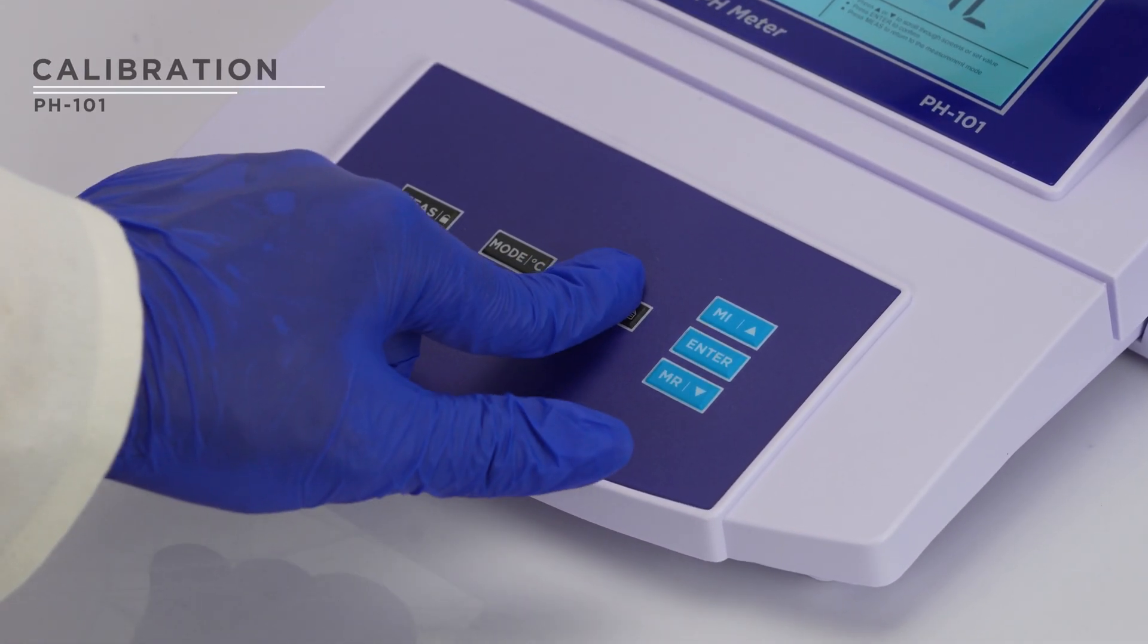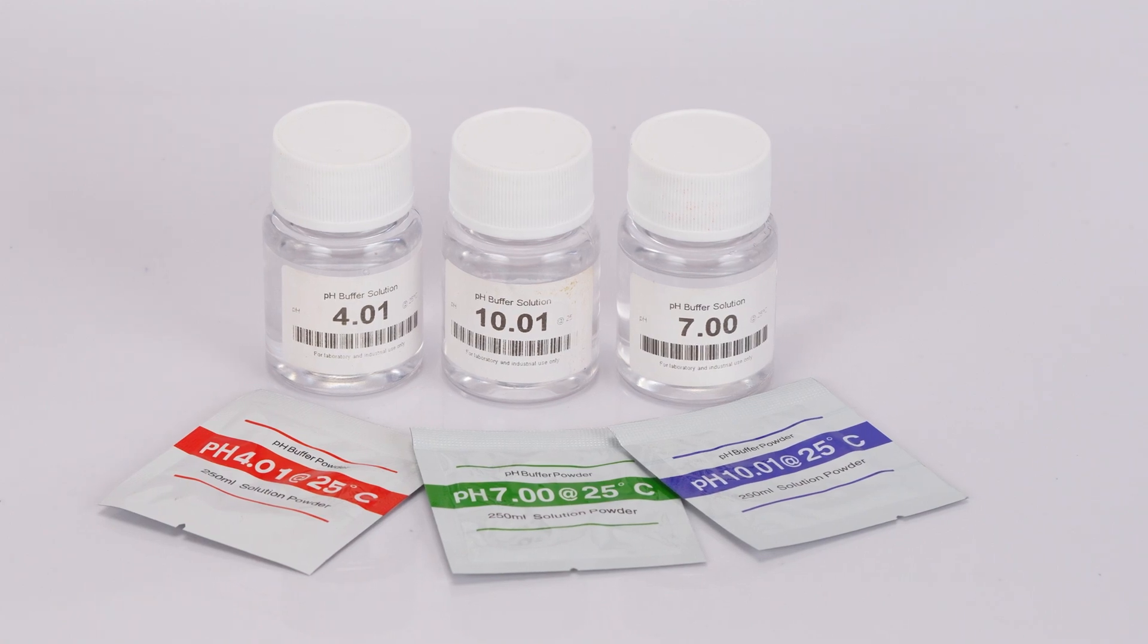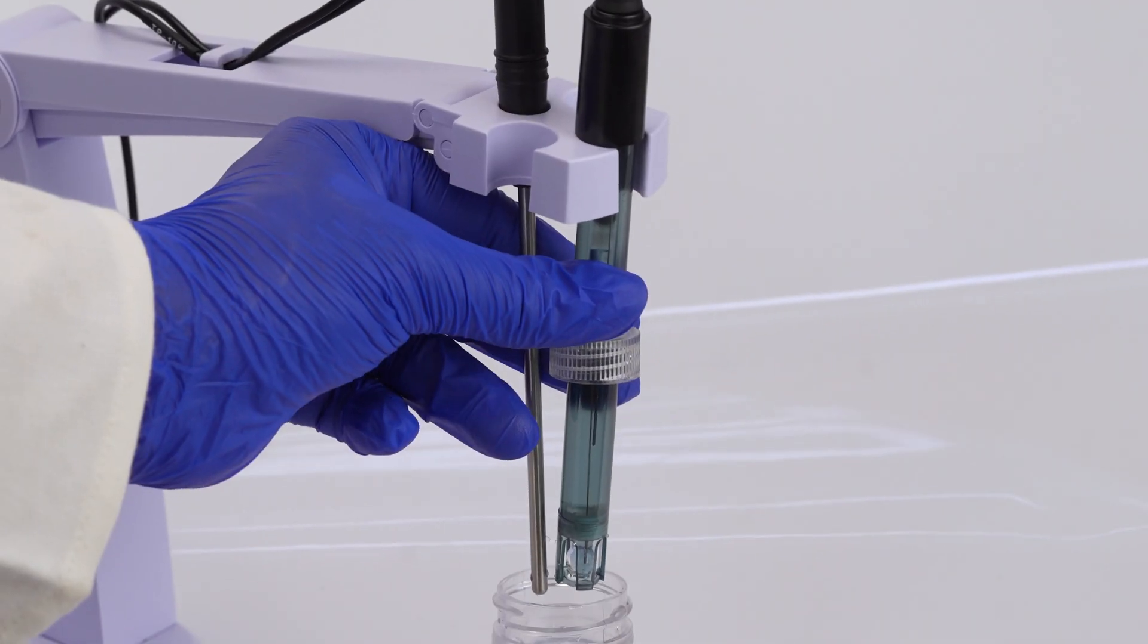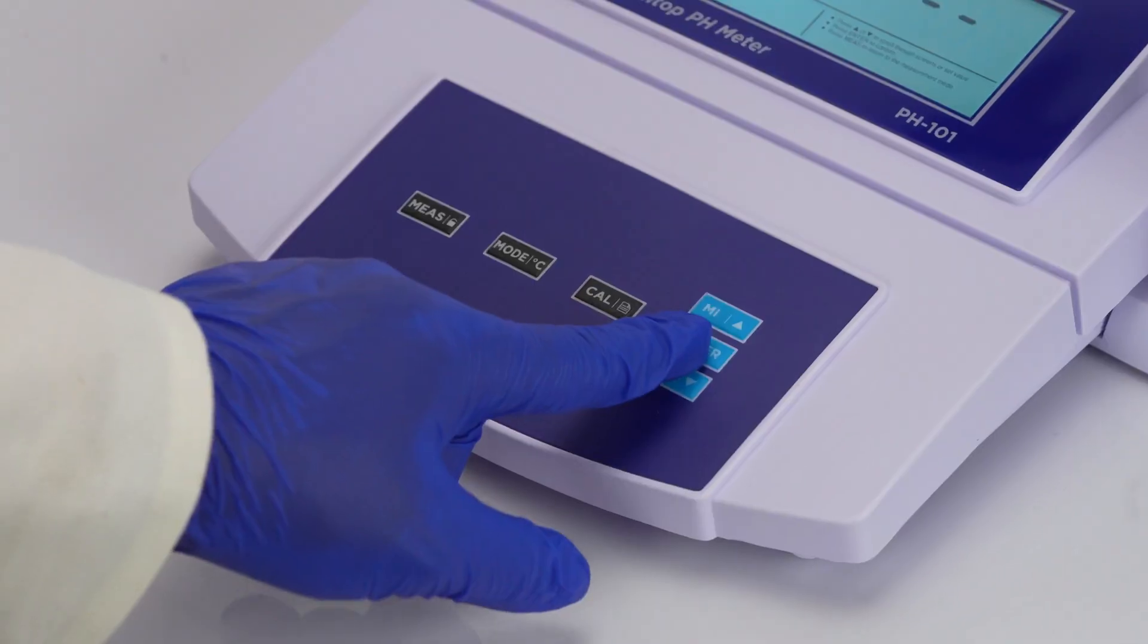Press the cal key to start calibration with three standard buffer solutions. Rinse the electrode, immerse it in the first buffer, and press enter.